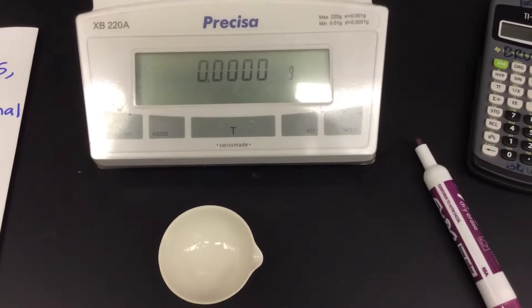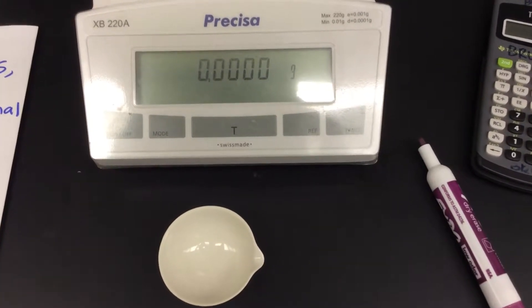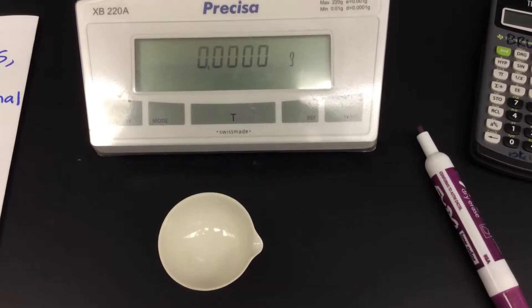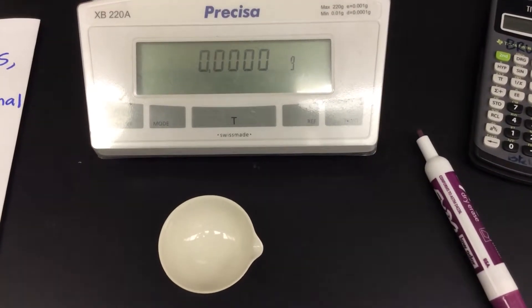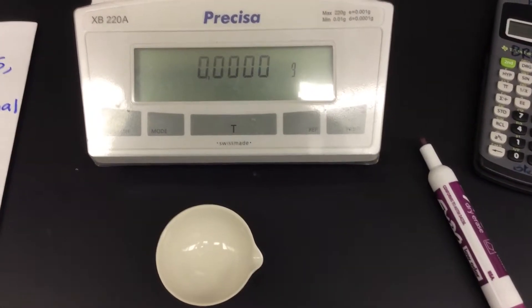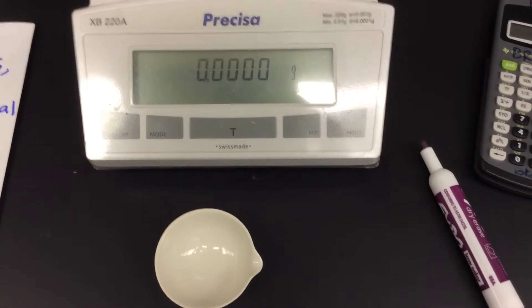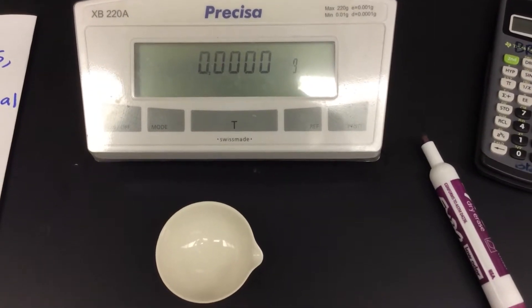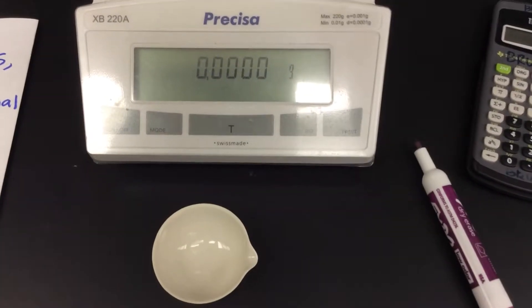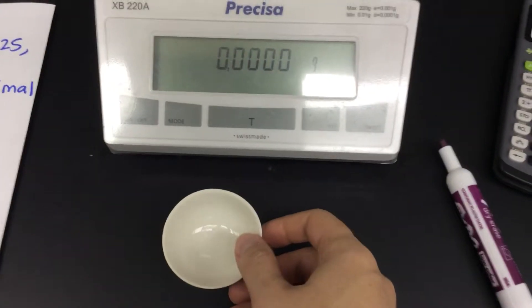In this video we will explore the effect of significant figures and how significant figures impact our calculations. So we're going to calculate the density of water. Now this is tap water. I'm not using deionized water. We're not going to get too obsessive about that. We're just going to use some tap water. And we can see how dense the tap water here in the city is.